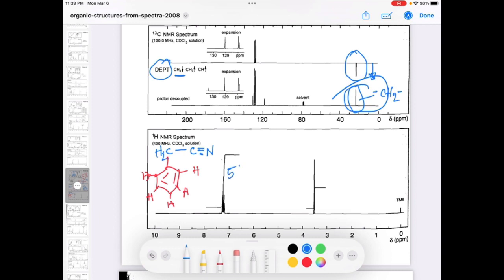This is the structure. Let's see in a clear form how we can see this structure. This is a CH2 peak and this is the benzene ring with five protons. We can say five proton benzene ring, and here two proton, that means CH2, and from the IR we clearly confirm that we have a nitrile group. So this is the final structure.